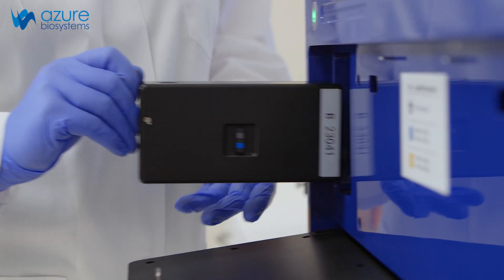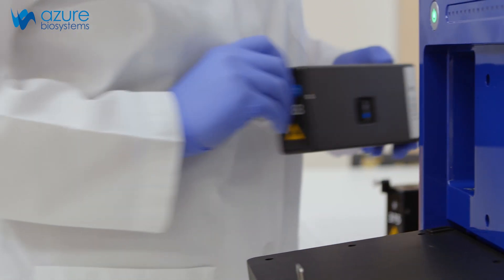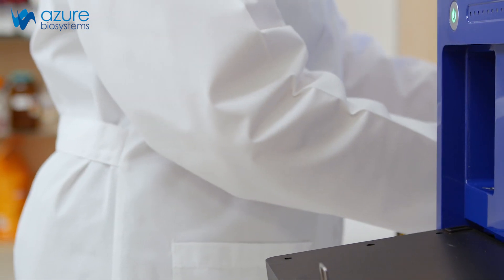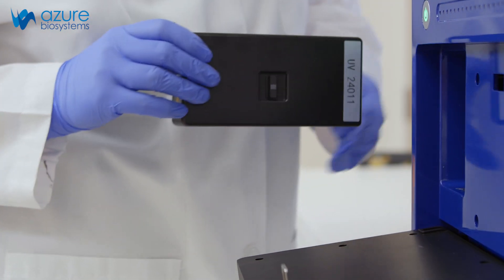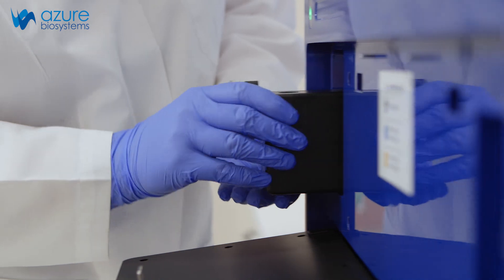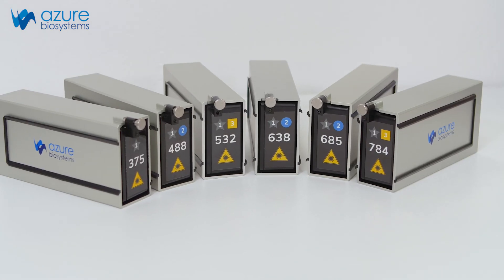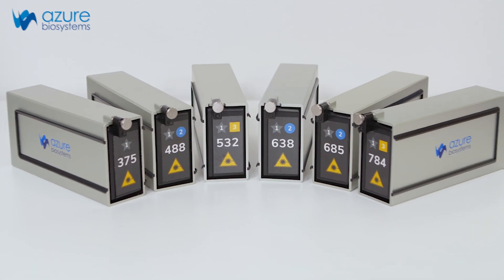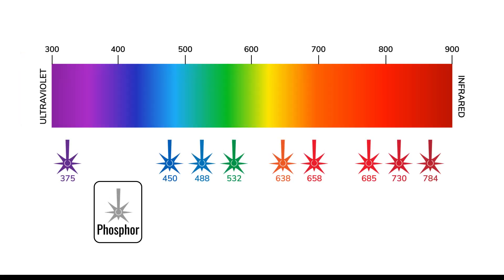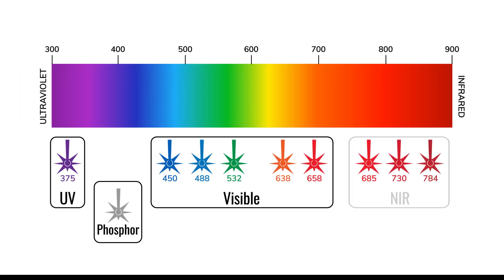The Sapphire FL features an unparalleled design of interchangeable and customizable optical modules. Optical modules can be easily replaced by the user, enabling support of a virtually infinite number of fluorescent dyes. The modular design enables users to choose the precise wavelengths their lab requires. Options include phosphor, UV, visible, and NIR imaging.